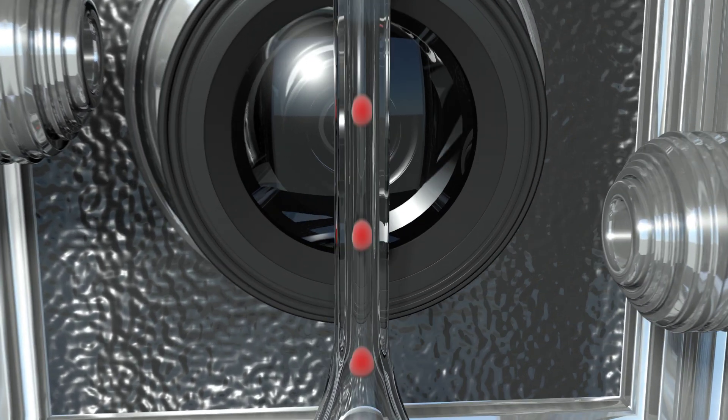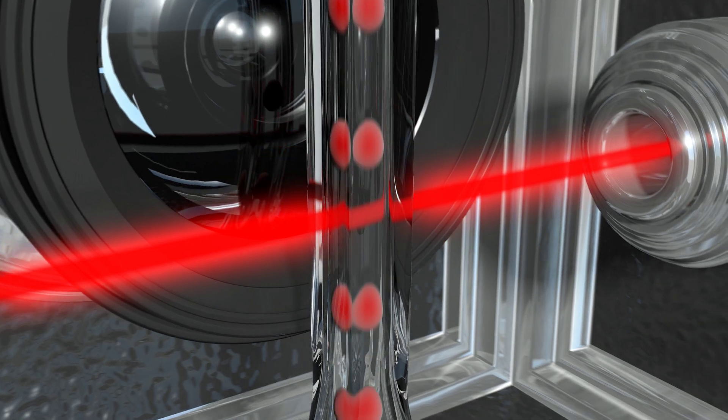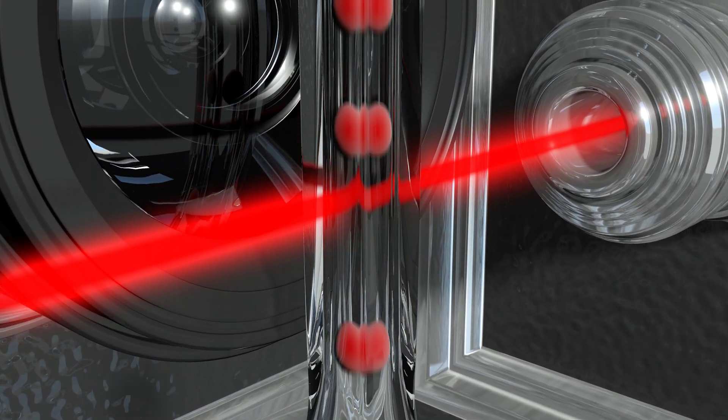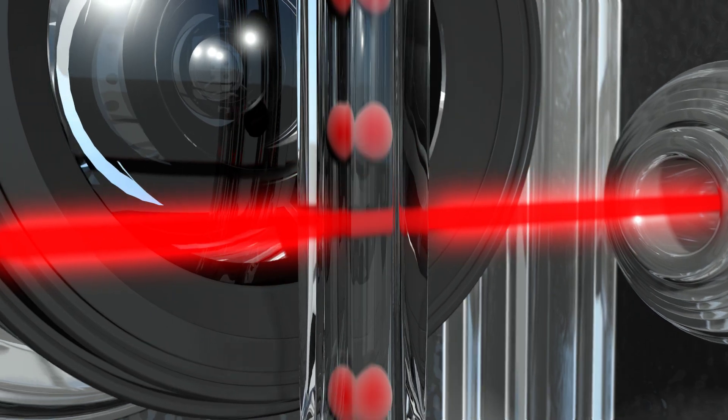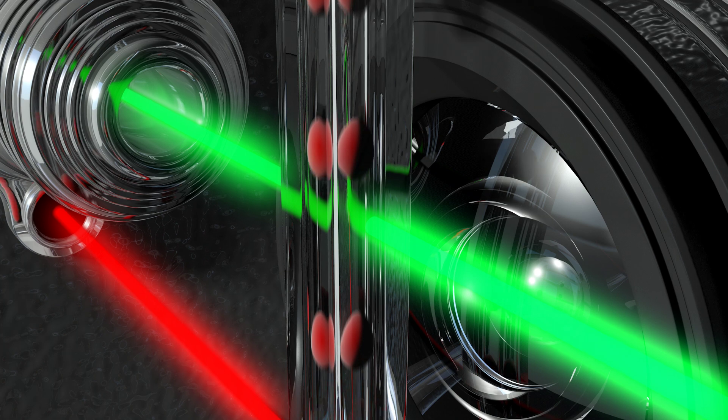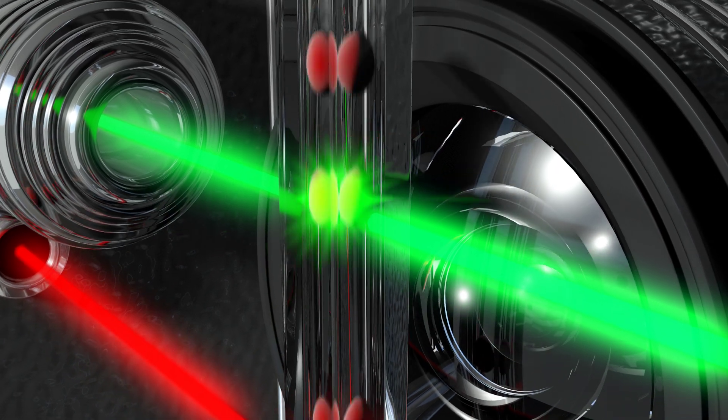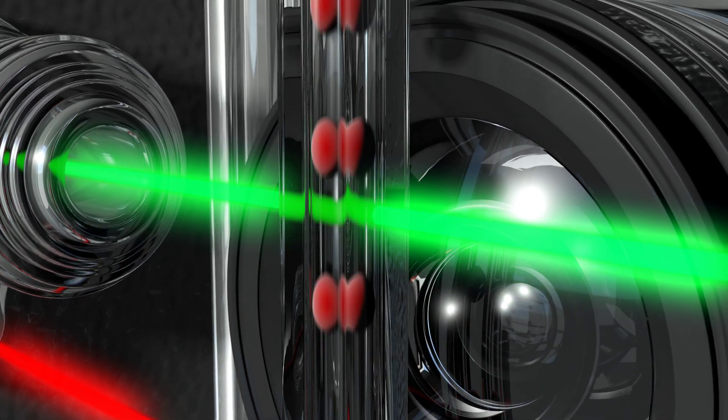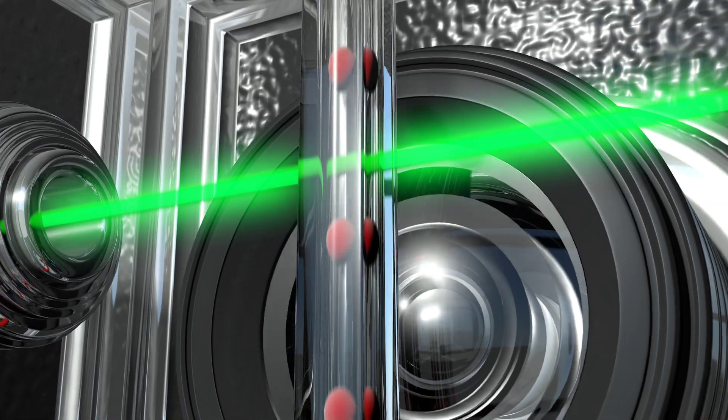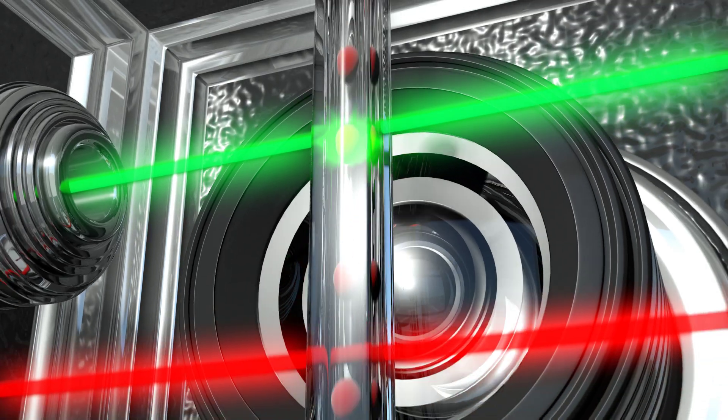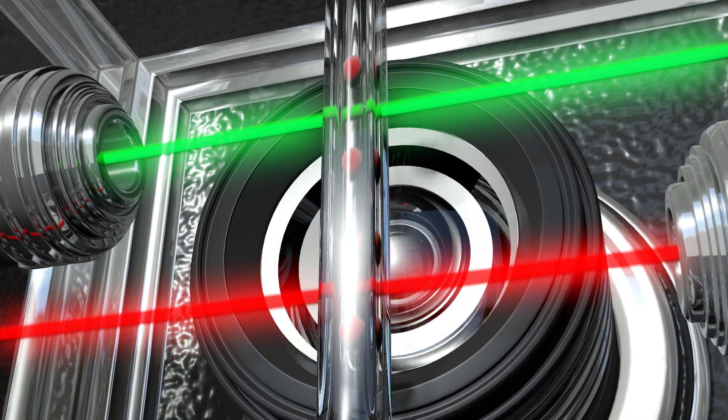As each bead passes through the cuvette, a red laser excites the internal dyes, allowing proper classification of the bead, which in turn identifies the analyte attached to the bead. A green laser excites the labeling molecule bound to the analyte on the bead, providing information on the amount of analyte present. Both classification and reporter readings are made on each individual bead, so the FlexMap 3D system is able to precisely determine multiplexed assay results.